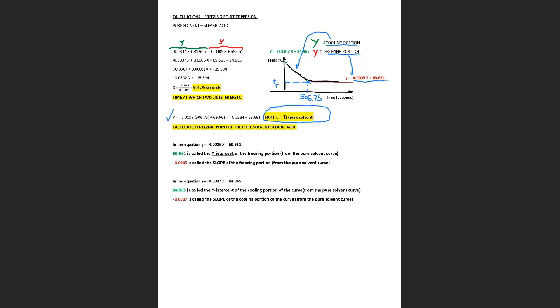In the report, they will ask you, that's why I wrote it here, they will ask you, okay, so you remember that a linear equation equals mx plus b. So how do you call b and how do you call x? They will ask you in the report, what is the y-intercept of the freezing portion? Let's say we are doing the pure solvent. What is the y-intercept of the freezing point portion?